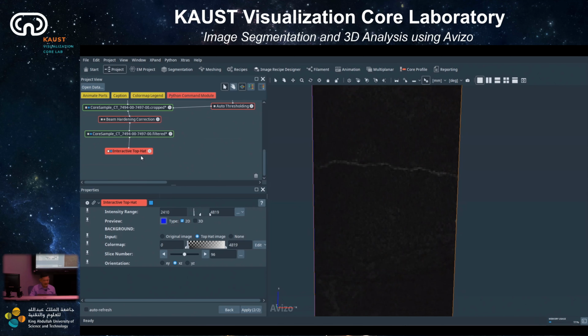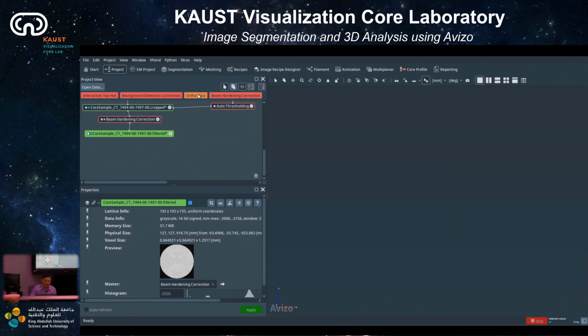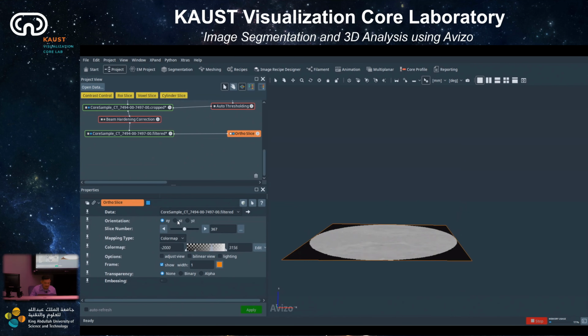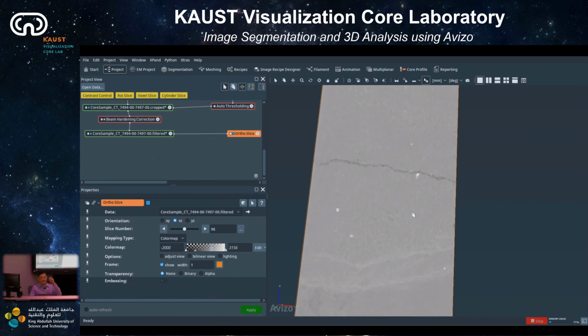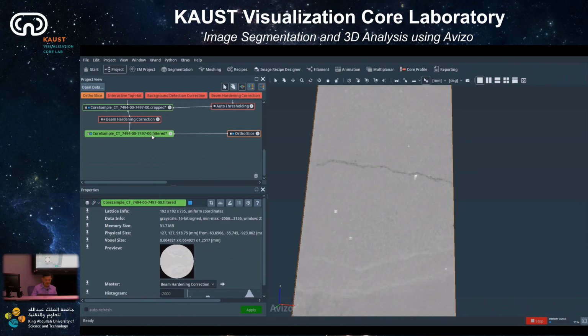Okay, so I will explain really easily. First thing, you look at this image here like this, and the first operation in the top hat image is that you have to do grayscale closing. So I'm going to do it right now. First, you do the closing on the grayscale.